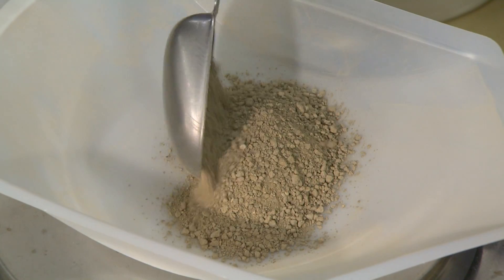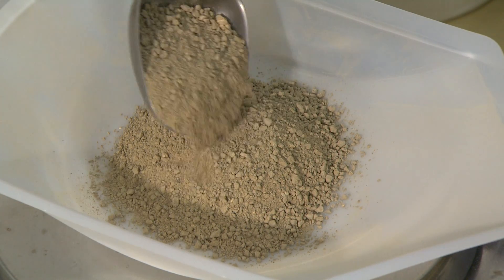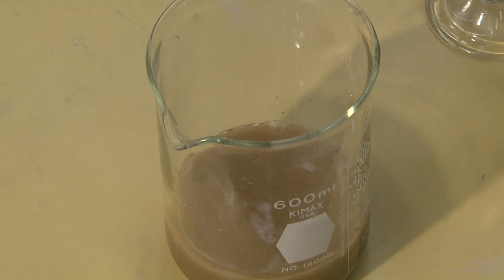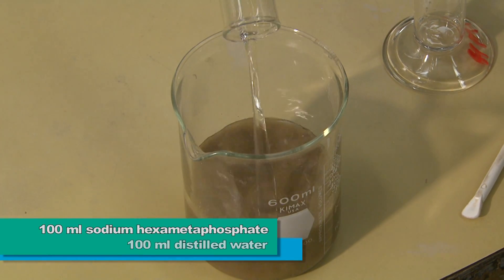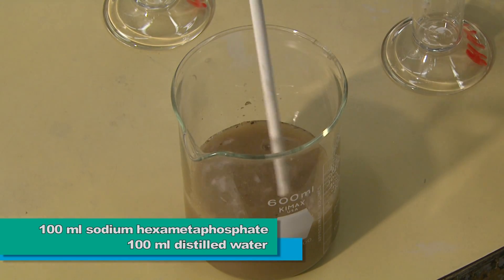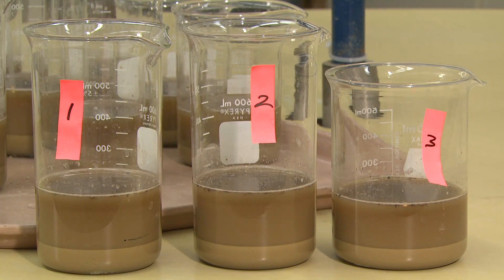If no special pretreatments are required, such as the removal of organic matter or carbonates — excess amounts of which might interfere with readings or give false particle size results — a dispersant is then added to the beaker. This consists of 100 milliliters of sodium hexametaphosphate solution along with 100 milliliters of distilled water.